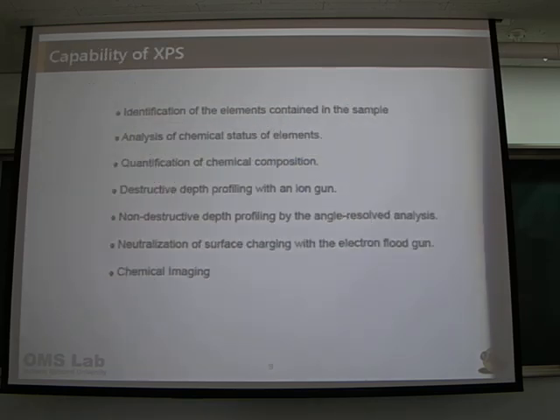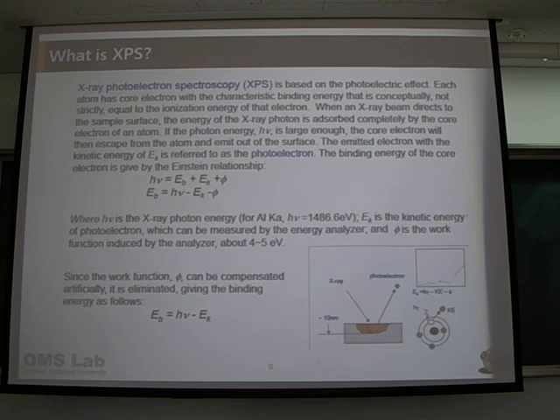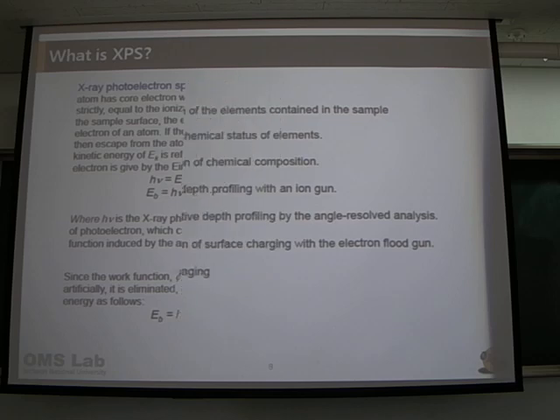Can you go back? So what are you measuring? In this case, this is the sample. I say that the X-ray, this means the incident comes from here. So you're applying the h nu, so X-ray. So this is the incident energy, and that is applied to your material, the atom, and what are you measuring?